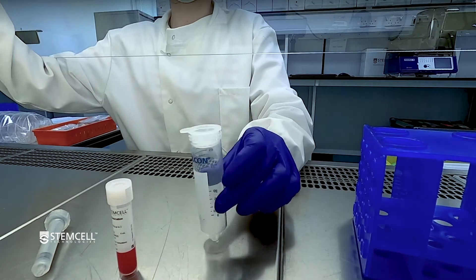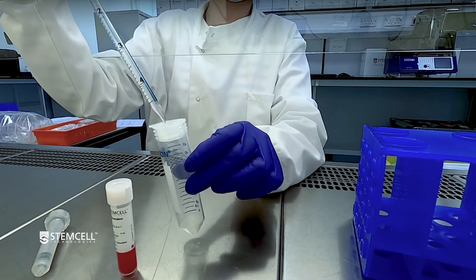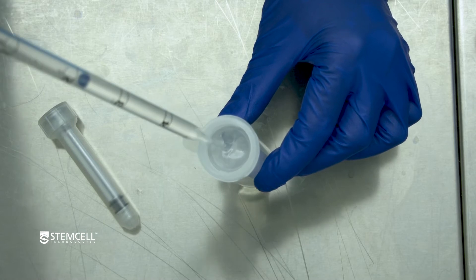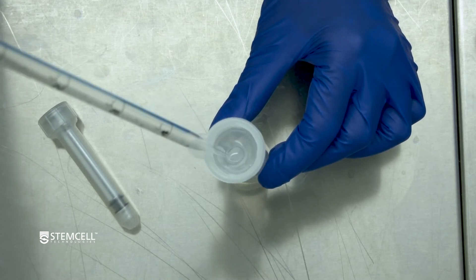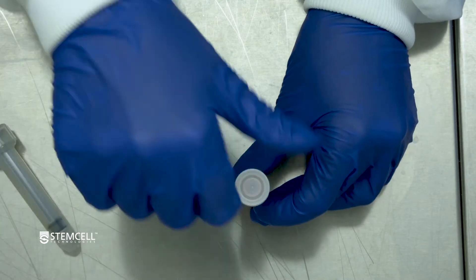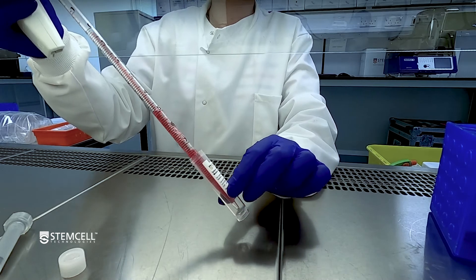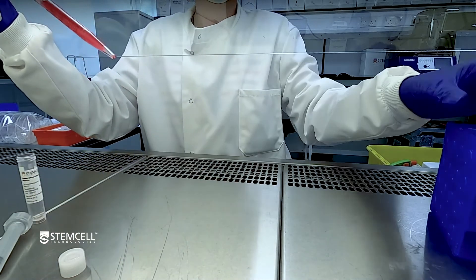After the 30 minute incubation, prime a 70 micrometer filter with 5 milliliters of PBS containing 2% FBS. We will now mechanically dissociate the spleen fragments into a smooth suspension. To do so, transfer the dissociated tissue and the dissociation medium to the strainer.